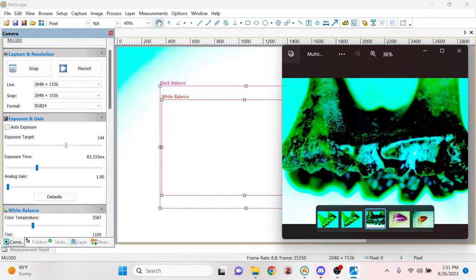What else do I want to pull up? Let's do Mesodma. Let's get this little guy up here. This is a teeny, teeny, tiny little mammal tooth.